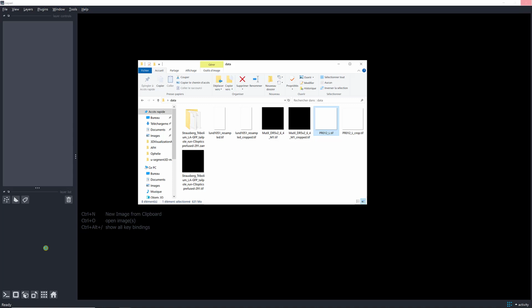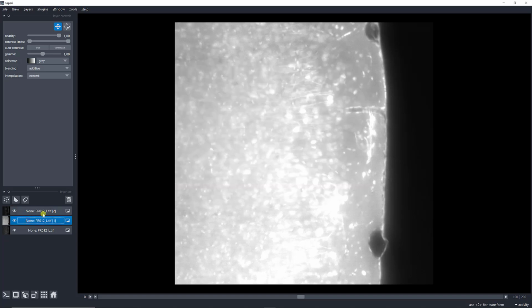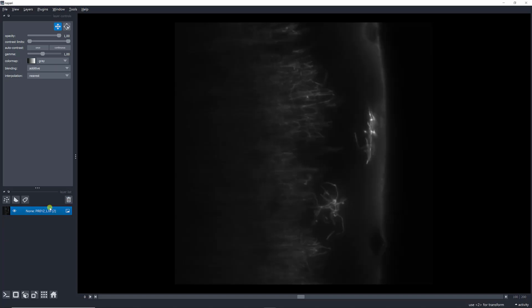I'm just gonna show you that you can then load again the pipeline and process the data, which is a nice feature when you want to process quite some data. And here you don't need to know how to program. So that's a nice feature when you are, like many biologists, not very fluent with coding. So this was called myelinated neurons. So it makes it clearer.